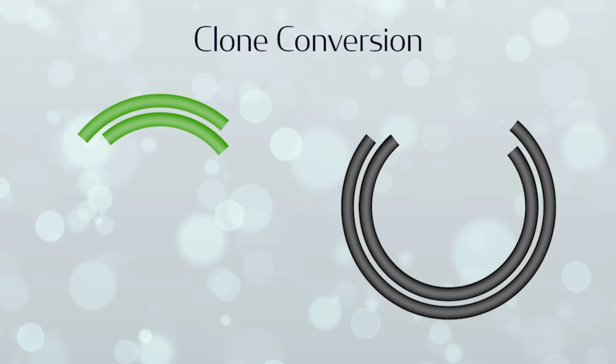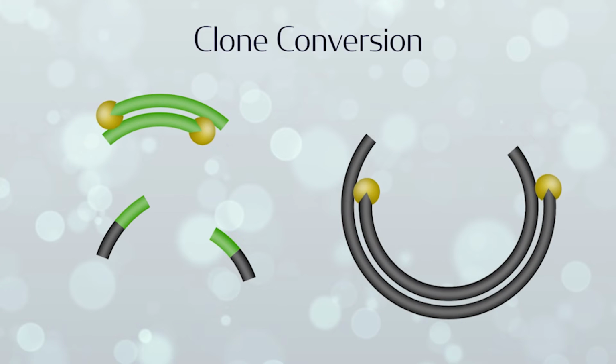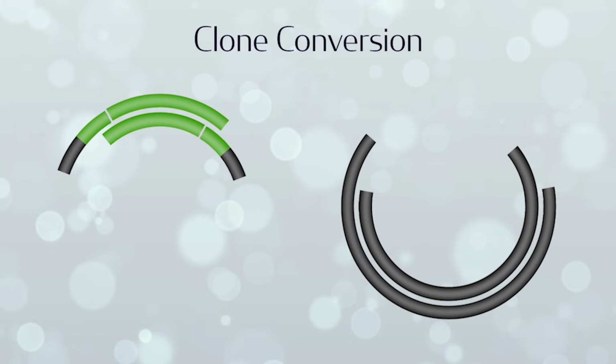Here, the designed DNA oligos with homologous sequences are added to the reaction. The 5' exonuclease chews back the 5' ends so the oligos can anneal. Afterwards, the DNA polymerase fills up the nucleotide gaps and the added oligo becomes double-stranded.